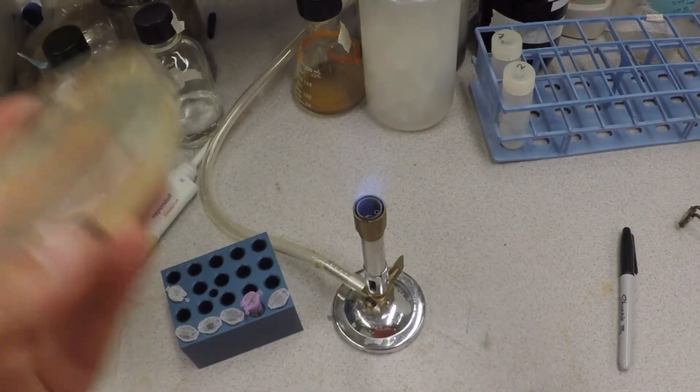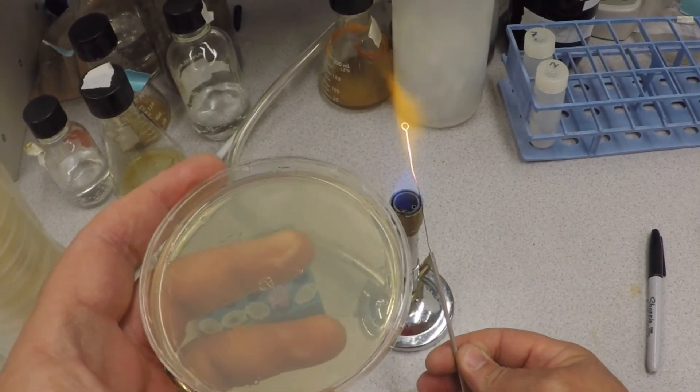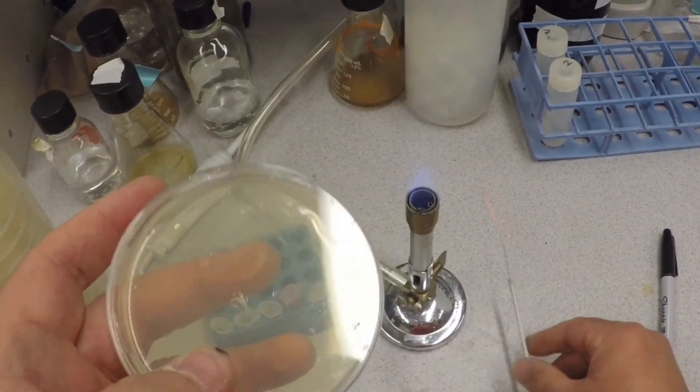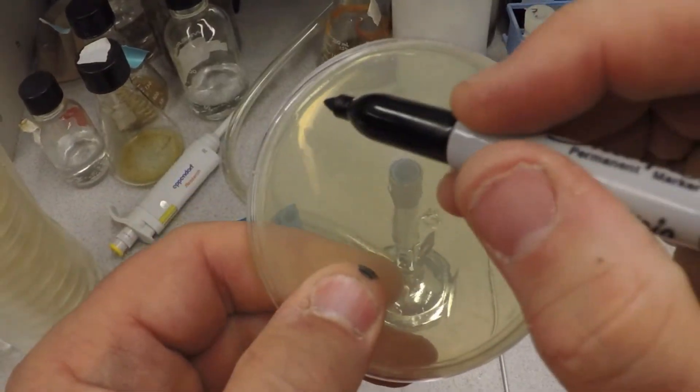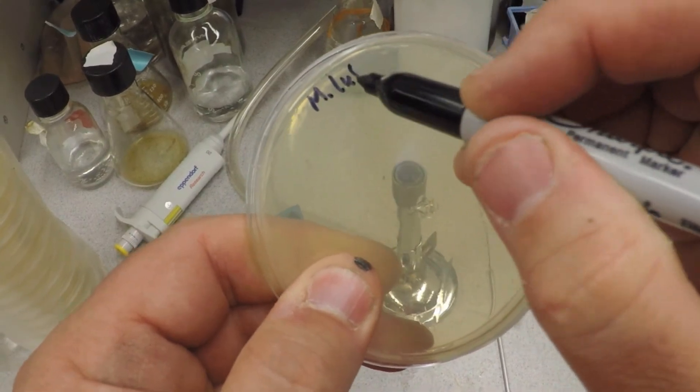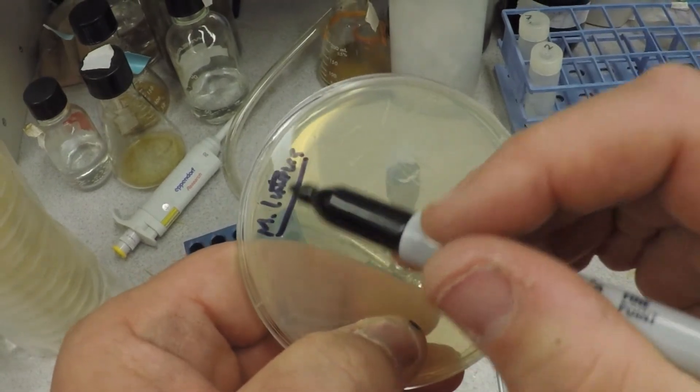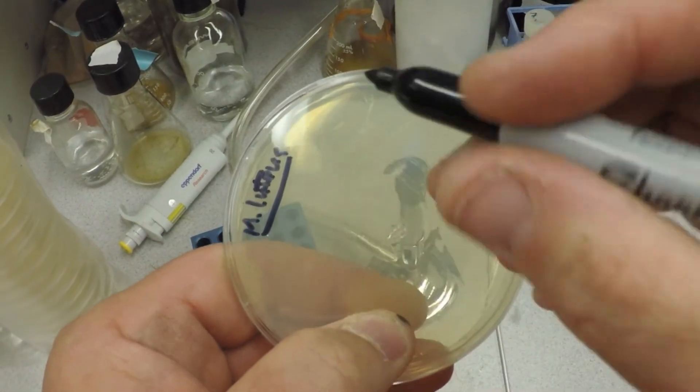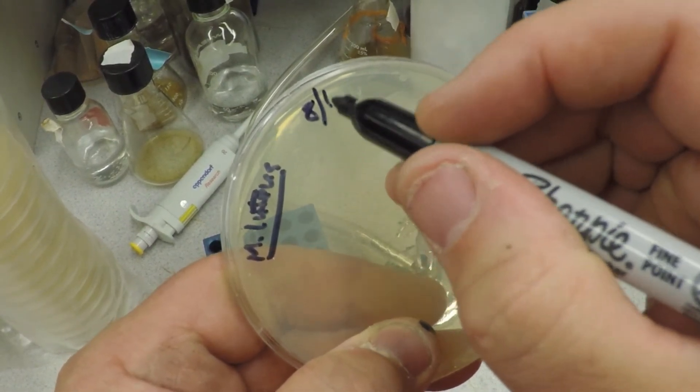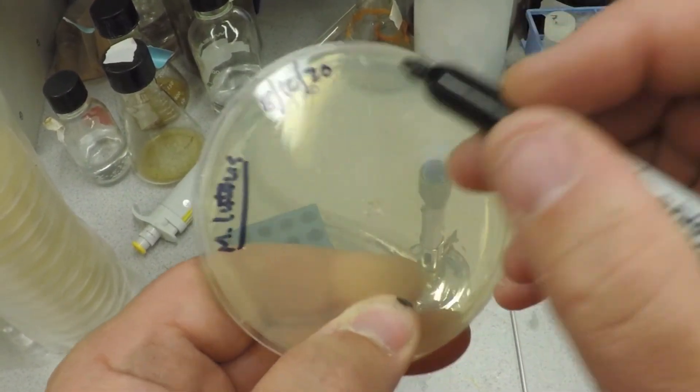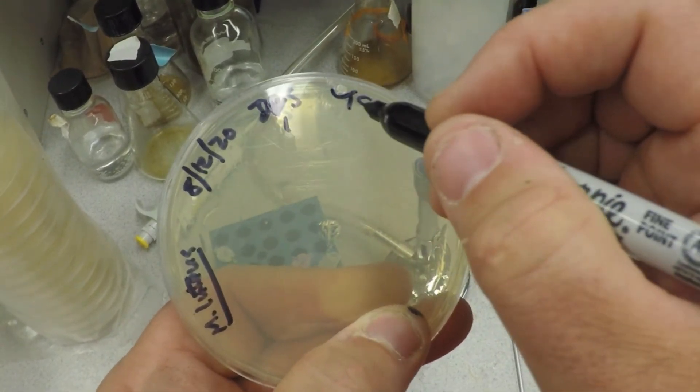You have to get a feel for it and get used to it. Now that's sterilized, I'll label this. It's M. luteus. It's a genus and species, so you should underline it or write in italics, I can't do that. Today is again the 12th, I'm DRS, and this is TSA agar.